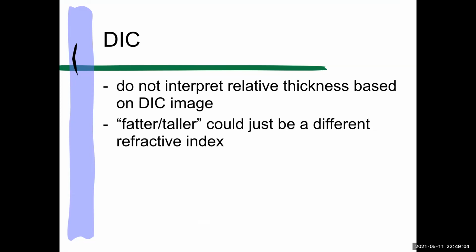Just because something looks thicker doesn't mean it's thicker. It might just be denser. And we have no way of telling just from the DIC image. It could be a different refractive index, or it could be thicker. It's going to look the same in DIC.